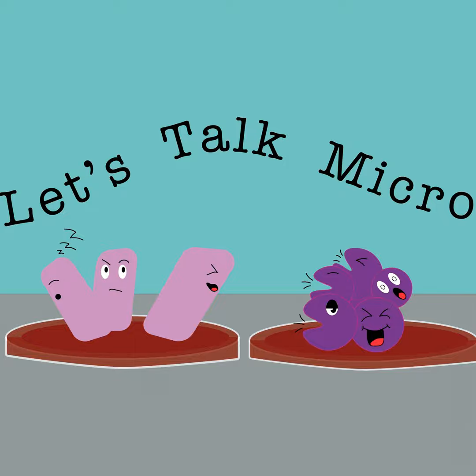When we were allowed back to teach in person, and we had students that had taken online courses, they had difficulty focusing with the microscope. So that's definitely something that you get used to, from putting your slide correctly, like you said, focusing, even being able to look with both eyes. That sometimes might take us some time. So the chance that they got to do this at home, right, it was definitely beneficial for them.